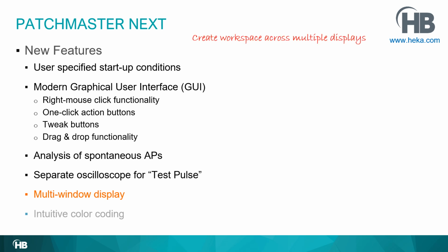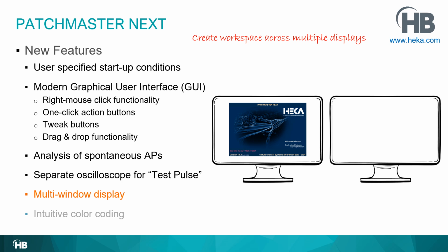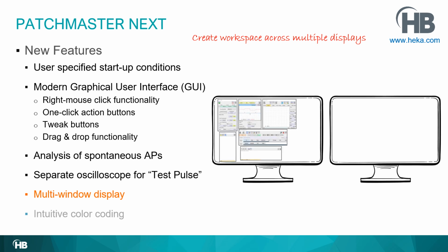Then there's another option, which is the use of multiple displays. So you can create a workspace across multiple displays, which is very helpful. So let's say you have two displays, and when you start PATCHMASTER, it starts up in one display first time. So this is the default view of the display when PATCHMASTER starts for the first time, or when you press use defaults.